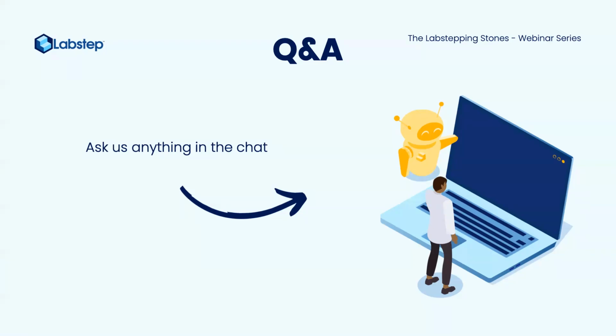How would you add sublocations by bulk? You could do this through the import resources way, no, you would do it through your item import. Anoä showed you how to add multiple items. You could attach a location, your sublocation, in bulk through that too. You separate it using the greater than sign, so you can build resource pathways through there. It's on the help center if you search for that too.